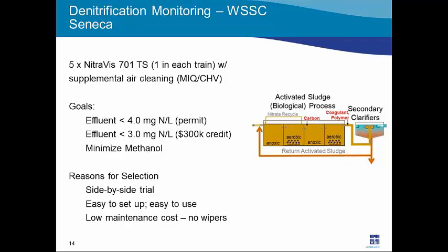And the benefit of this, they found, was that even though the ultrasonic cleaning was keeping the fouling off, say the biofouling, they were finding that hair and rags and other things were getting lodged in the measuring gap. And so the supplemental air cleaning effectively cleared those items that got stuck in there and gave them longer-term reliability. They still pull the probes out weekly to flush them out with a little water and take a look at them, but that's it.